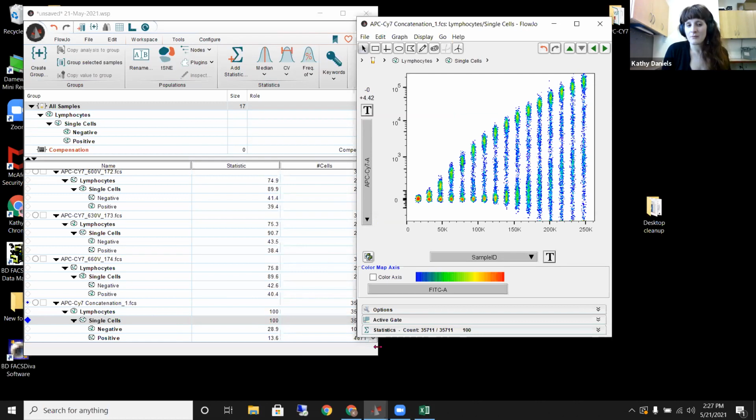There are alternative methods where you can use the peak 2 method where you have unstained cells and a hard dyed bead that you can go ahead and do a voltage walk up with, which is something I'm going to be testing out. But in a previous institute, we went ahead and did this on all of our instruments and have it available. So at Memorial Sloan Kettering, where Rui's at, we have all that data there.